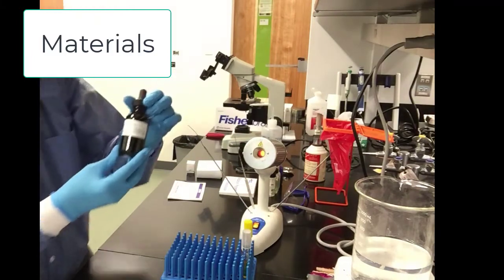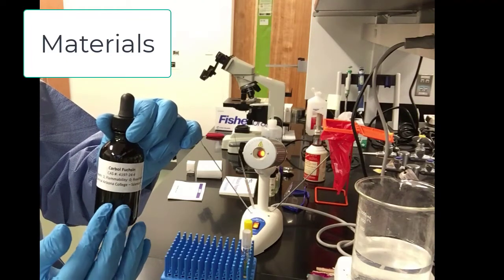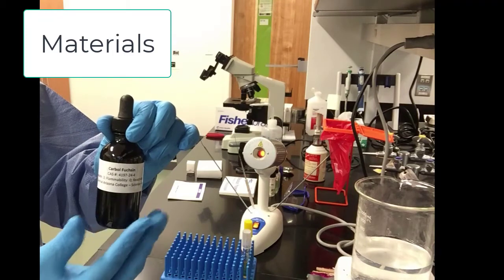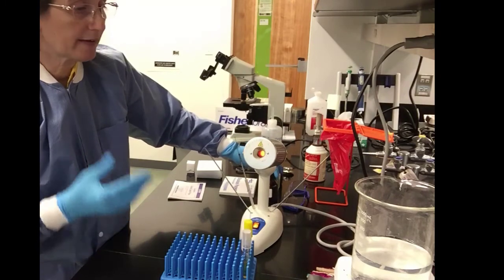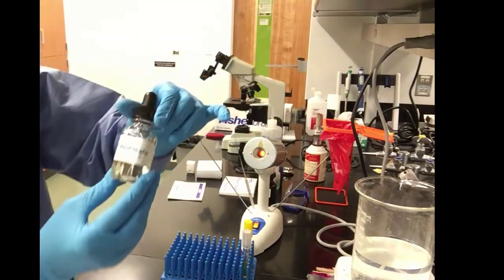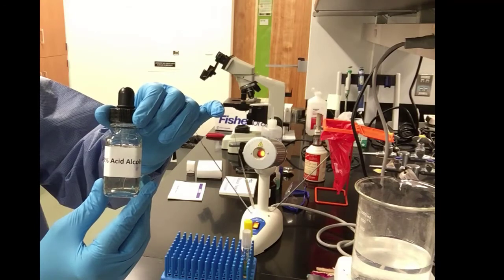Other items that we will need: carbolfuchsin, which is the primary stain, and this is the one that's lipid soluble. It's nicely absorbed by the Acid-Fast positive bacteria that have the mycolic acids because it's, again, lipid soluble, so the lipids pick it up nicely. We will use acid alcohol. Acid alcohol contains hydrochloric acid and ethanol.